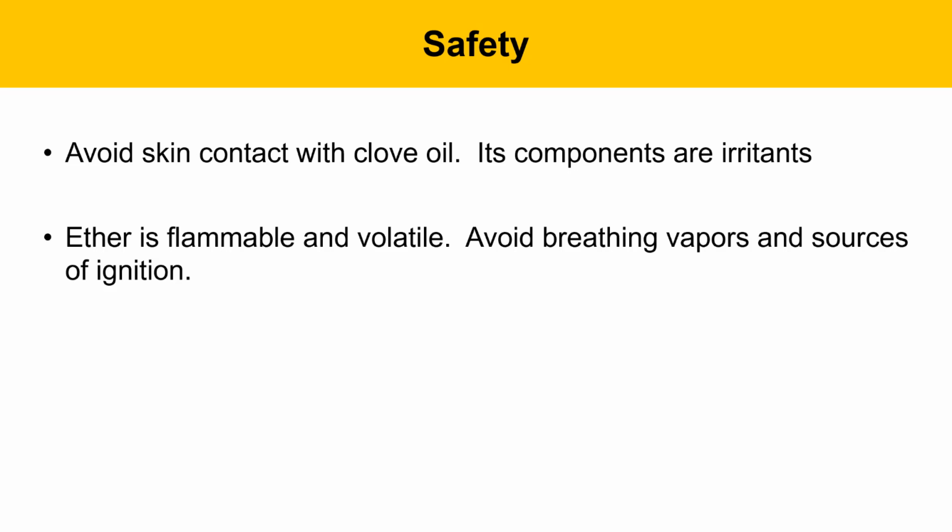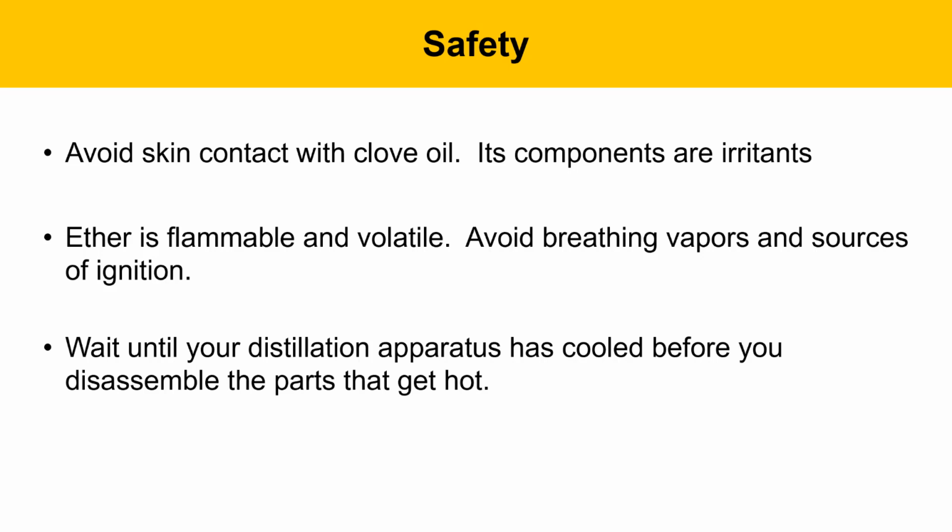Ether solvent is flammable and volatile, so avoid breathing those vapors and sources of ignition. We're doing a distillation today, and you'll want to wait until your distillation apparatus is cooled before you disassemble the parts that get hot. This will just prevent vapor from escaping into the lab.